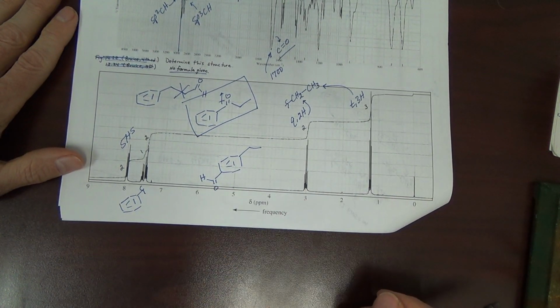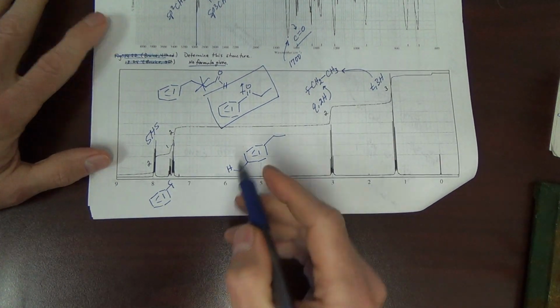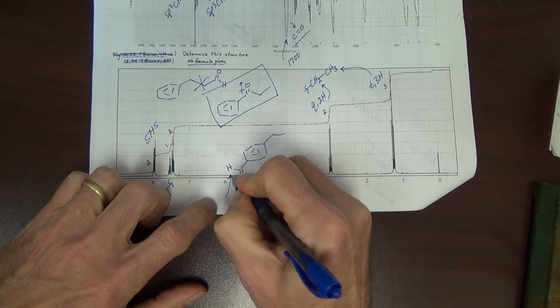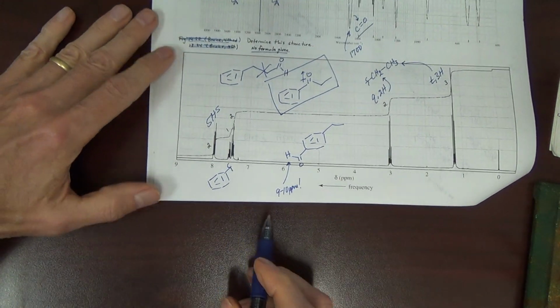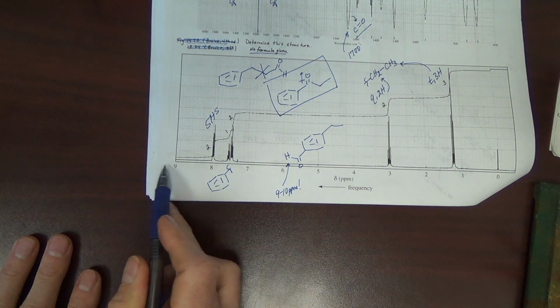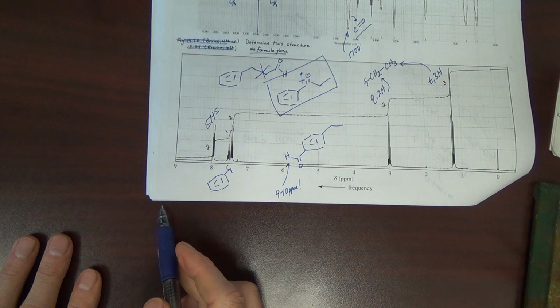What's wrong here? First off, this structure has an aldehyde H, and this is, if you remember, about 9 to 10 ppm in the proton NMR, and that's simply not there. If there was anything there, it would have been shown.